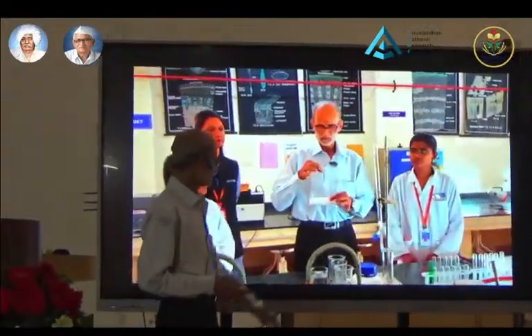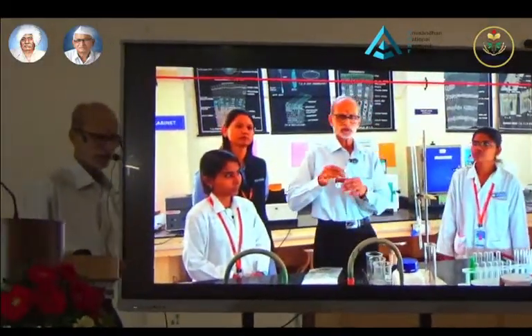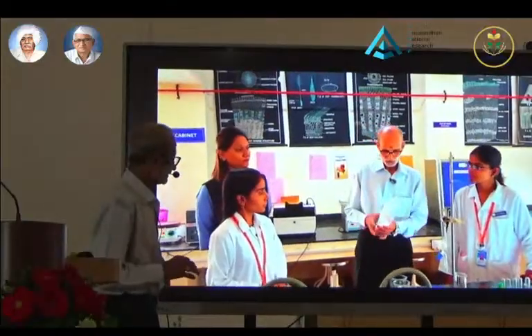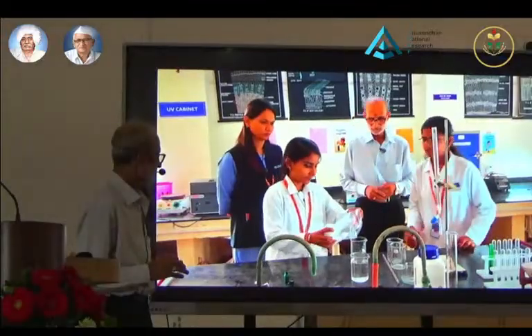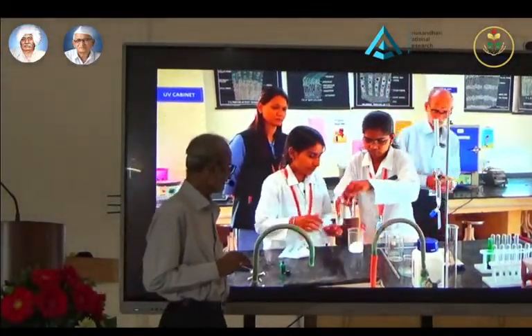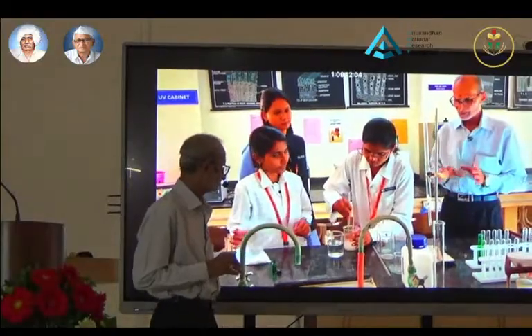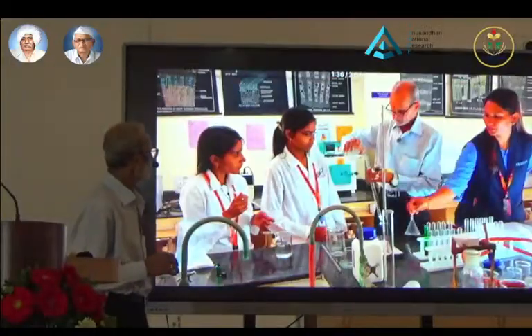We are using silica gel, around 60 to 120 mesh, which is typically meant for column chromatography. We are using water as the eluting solvent. A slurry in water has been made and put into the column.